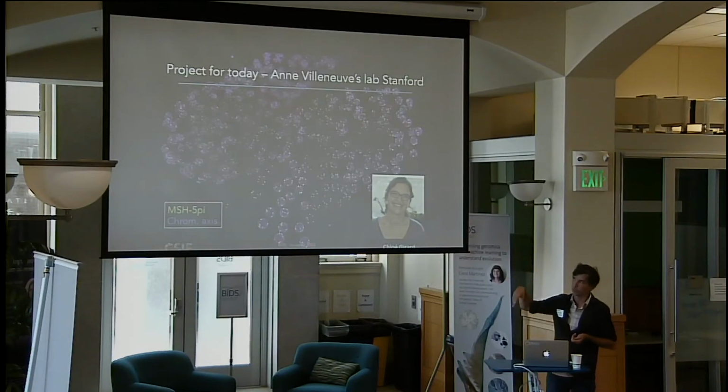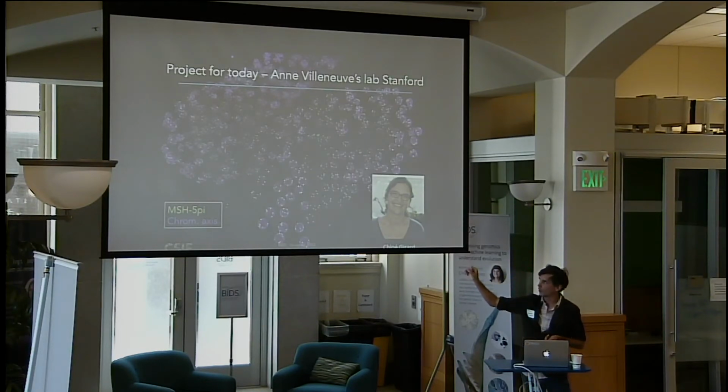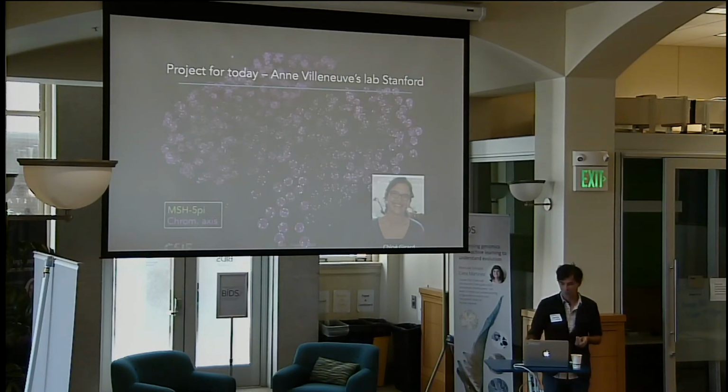So they will go into ImageJ and find the nucleus, so this little circle, and then count the number of green dots there are on the nucleus. And they wanted to have a more automated way to do it, to spend less time in front of the computer, basically. And also to be more reproducible, with different people getting the same results.